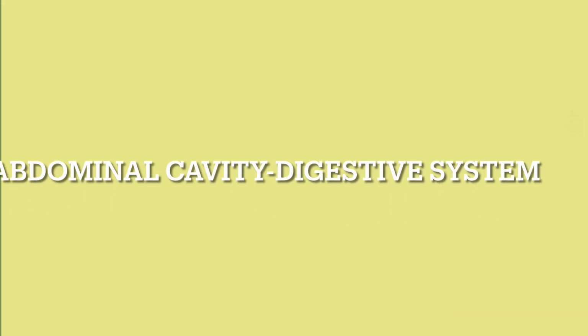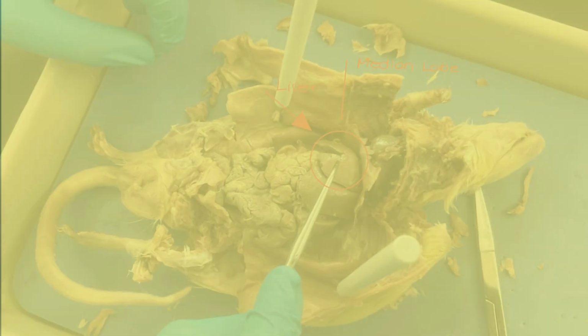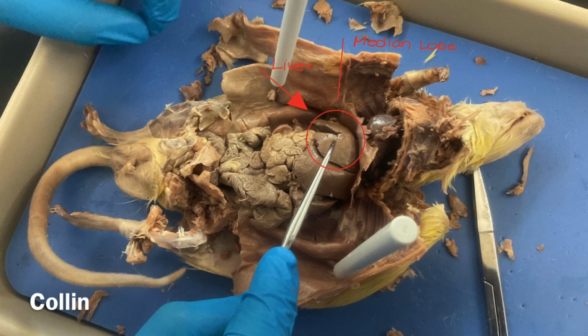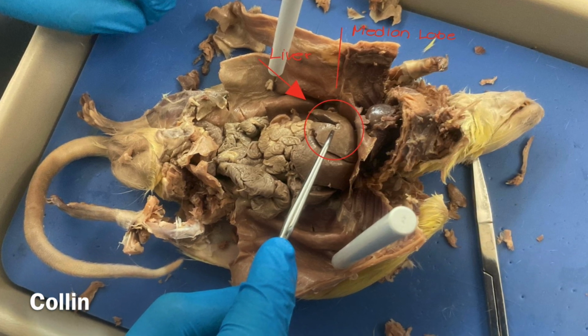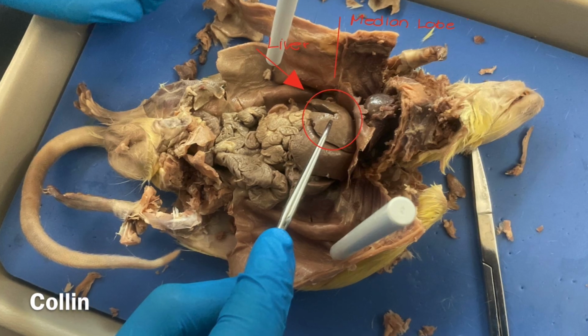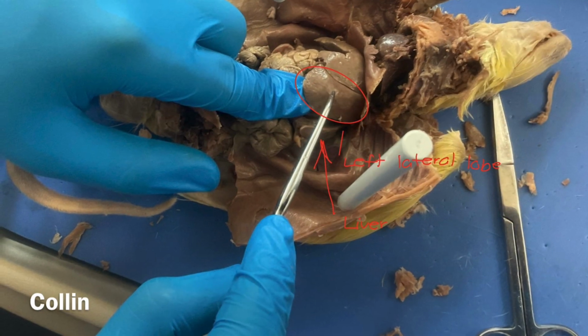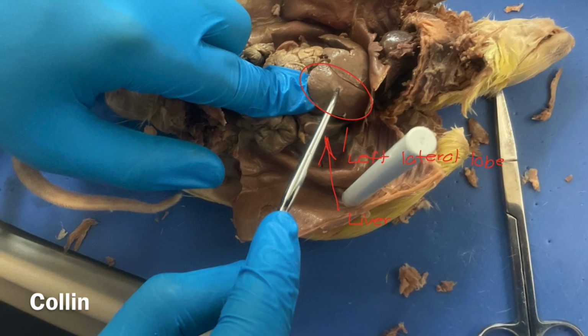This is the rat's digestive system. The liver is located in the abdominal cavity and is the largest internal organ, located just caudal to the diaphragm. It is broken up into 4 lobes.